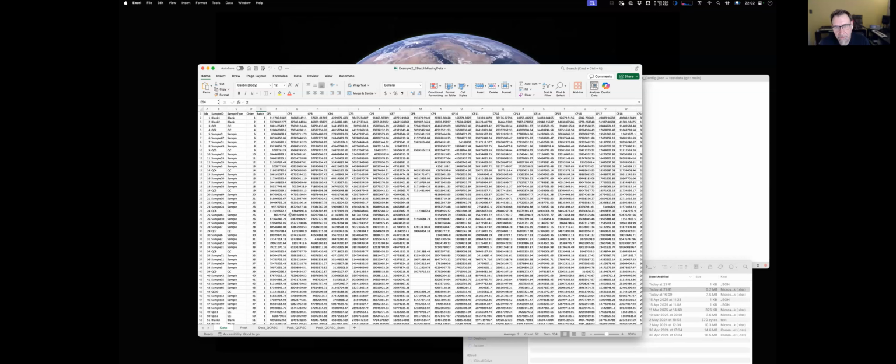So a couple of things. The pooled QC can be anything. It can be a reference sample. It can be a bought-in standard. It can be whatever you like. The important thing, as the question alludes to, is that there's sufficient representation of the metabolites that you're interested in in that pooled sample. As long as that pooled sample is identical across all the batches or within a batch, and then a different QC for between batches, that's what's important.